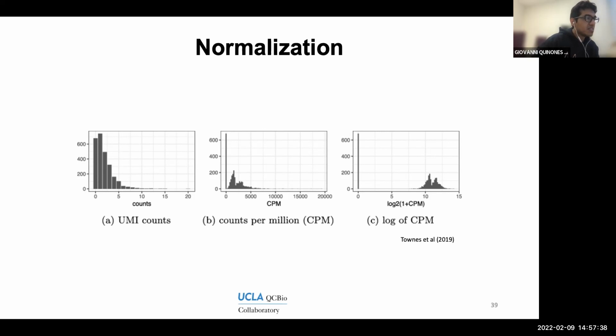And the reason for this is that all the rest of the values that are greater than 0, they are getting transformed and they're getting shifted, while 0 remains 0. And you can think of what's the problem with this data transformation is that now the difference going from 0 to higher values is no longer continuous. It becomes almost a binary problem. It's either 0 or it's something greater than 0.